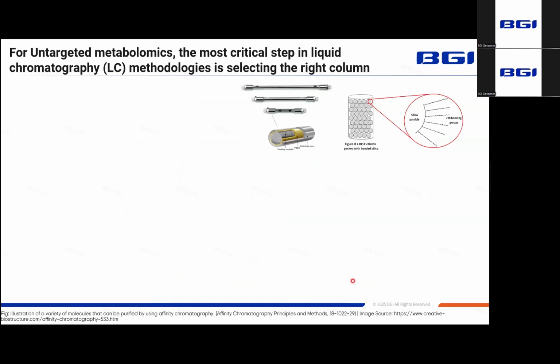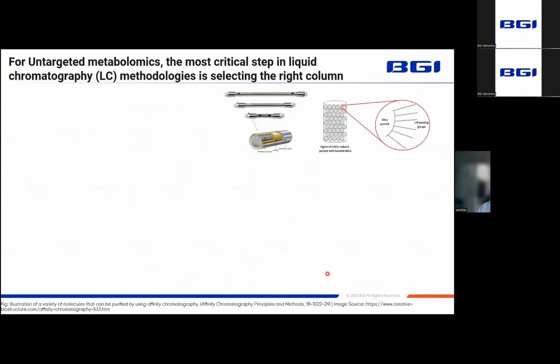Untargeted metabolomics is the most exploratory method, ideal for discovering unexpected metabolite changes. It provides unbiased coverage of thousands of metabolites. However, its complexity lies in data processing. The wide dynamic range of metabolites and variable ionization efficiency make quantification analysis difficult.